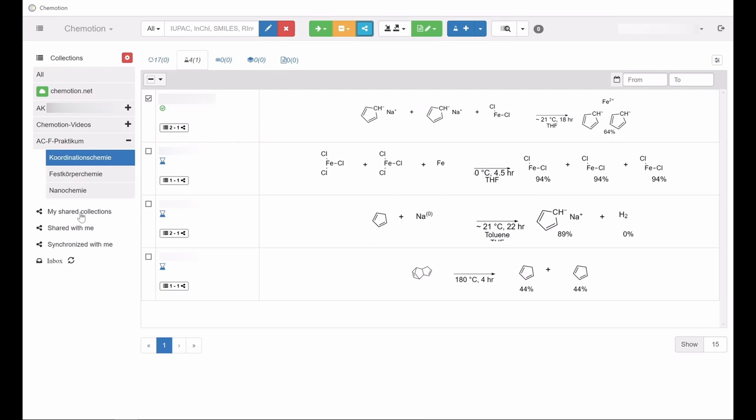In the same column directly underneath, you have access to any collections that have been shared with you.